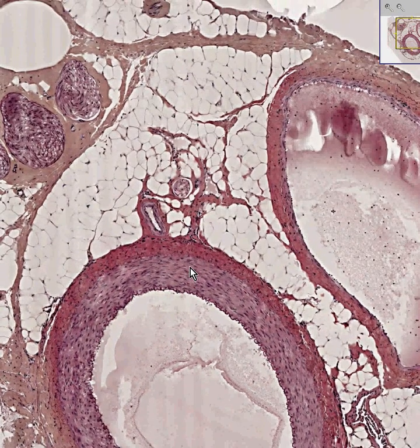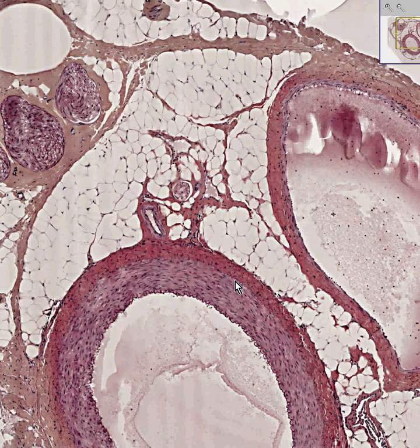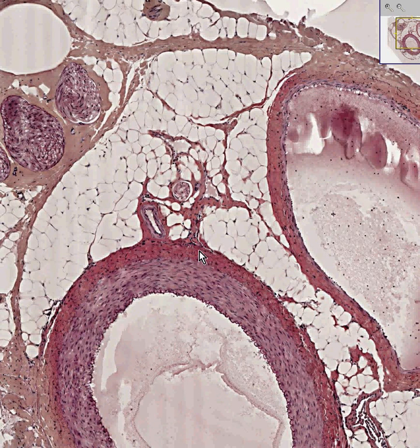You could see classically, the wall of the artery is very thick and very rigid, and the stain is relatively redder in the collagenous tissue of the adventitia, relative to the lighter, pinker smooth muscle of the media.